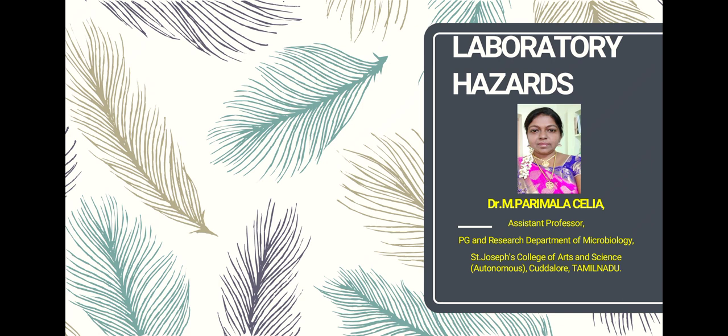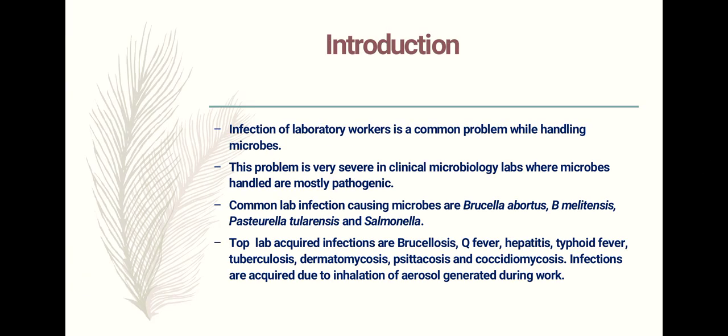I am going to present a topic on laboratory hazards. Now let's see the introduction. The infection of laboratory workers is a common problem while handling microbes.